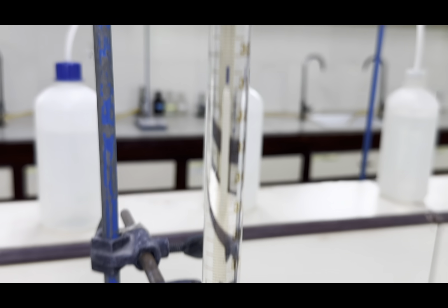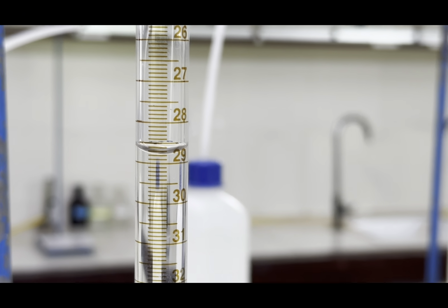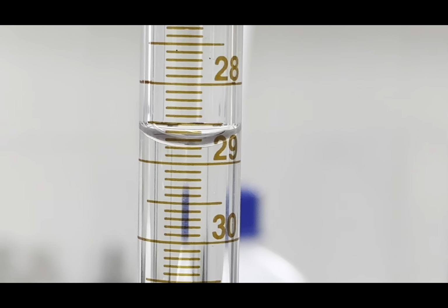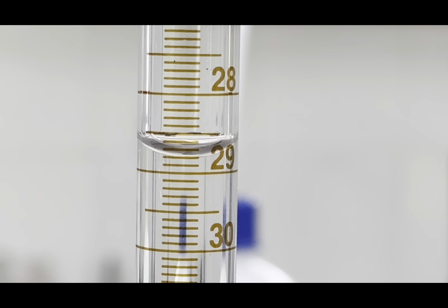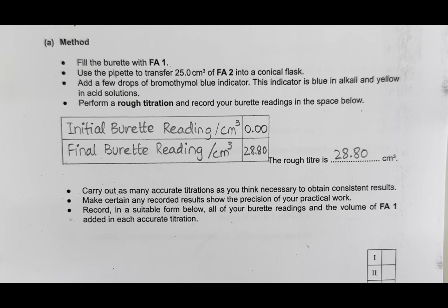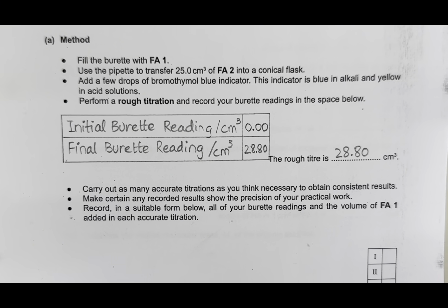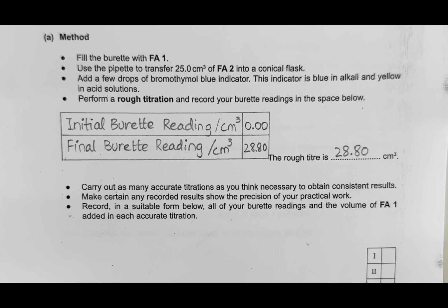Now look at the reading, and exactly where is the reading? If you look closely, the reading is at lower meniscus. The reading is exactly at 28.80. Final burette reading is 28.80. So the rough titer is 28.80.